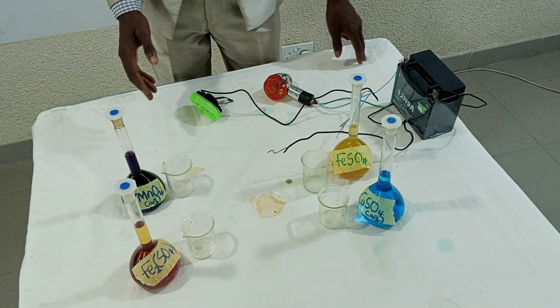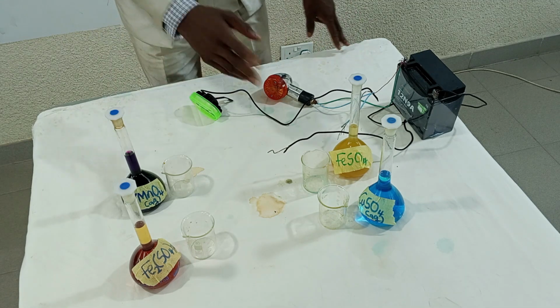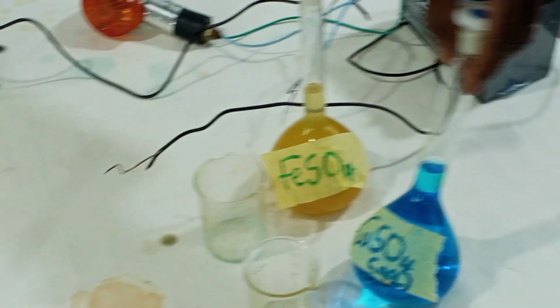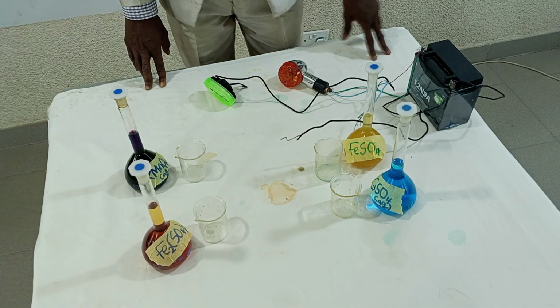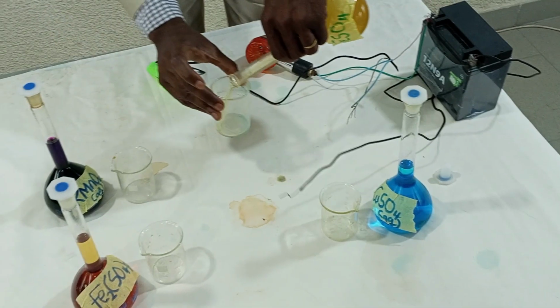Also, I have with me four compounds, aqueous solutions of four salts. We have iron 2 sulfate, copper 2 sulfate, iron 3 sulfate and potassium permanganate. Now, all these four salts can also conduct electricity. I would like to demonstrate each. For instance, we are starting with the iron 2 sulfate.